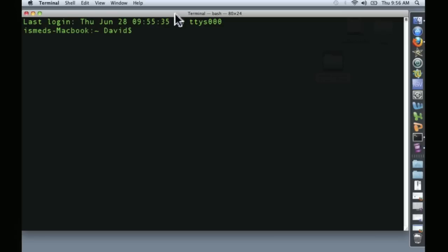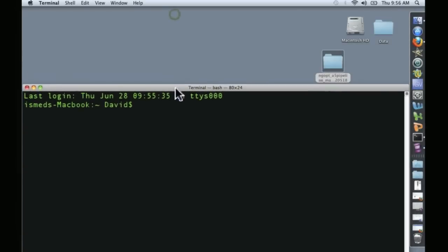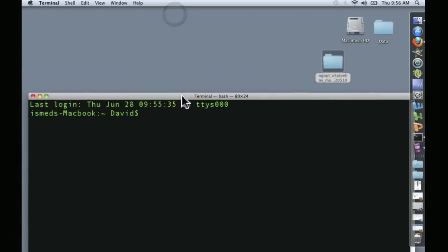And to run A5 you don't really need to know Unix. Just follow the simple steps that I'm about to show you. So here you are at the command line.